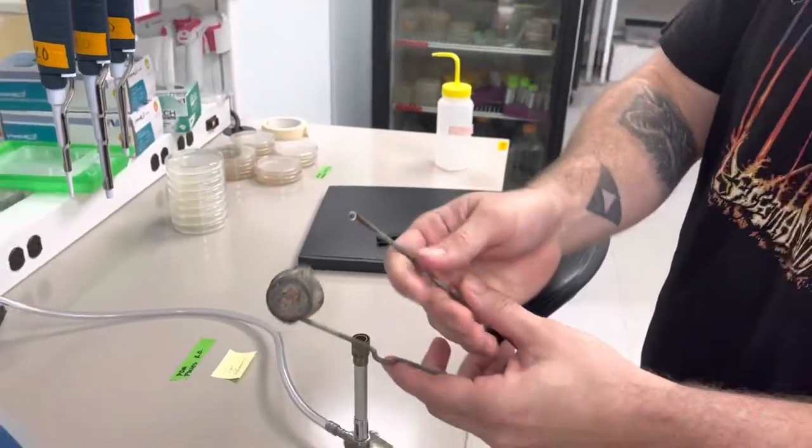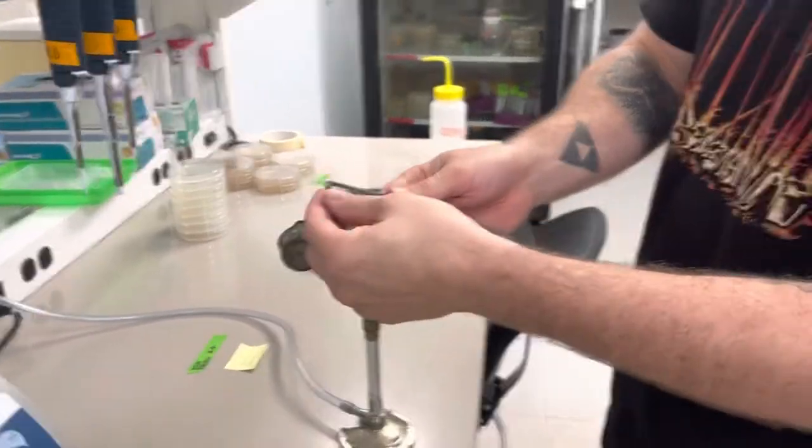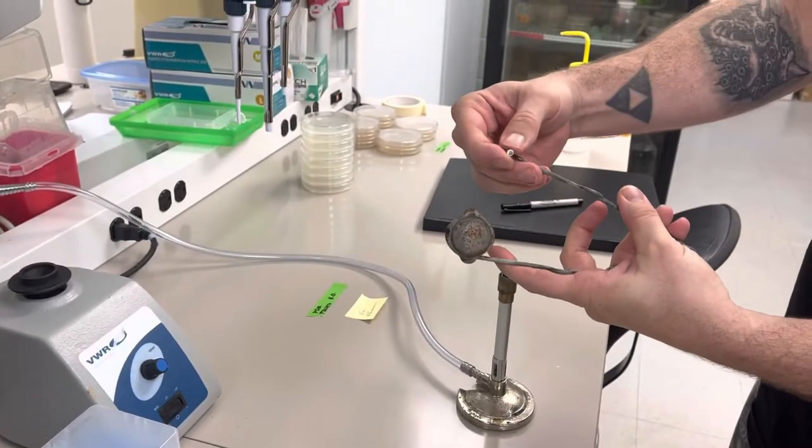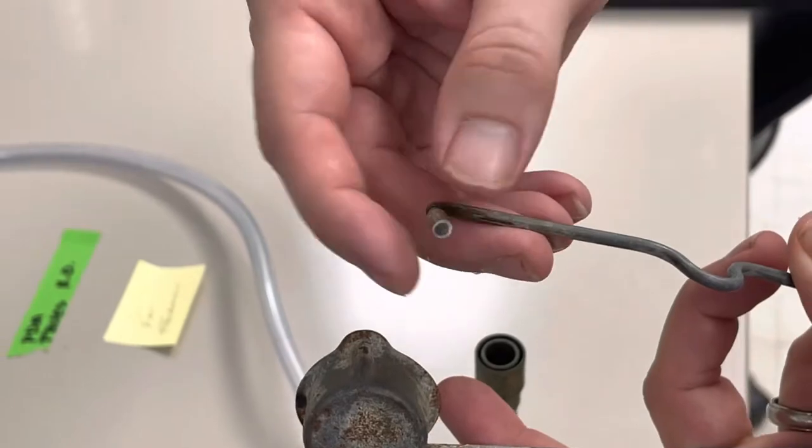The flint wears down, so in order to fix this you have to change the flint. This just unscrews. You can just twist this. It literally just unscrews and you pull it off. You throw that away.